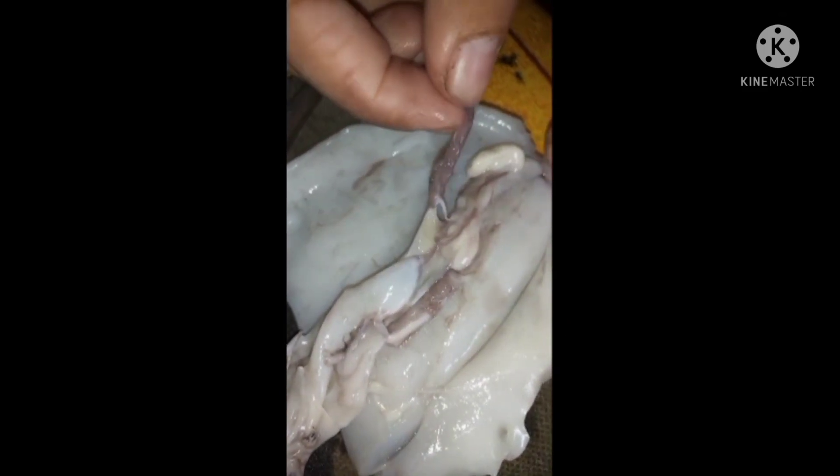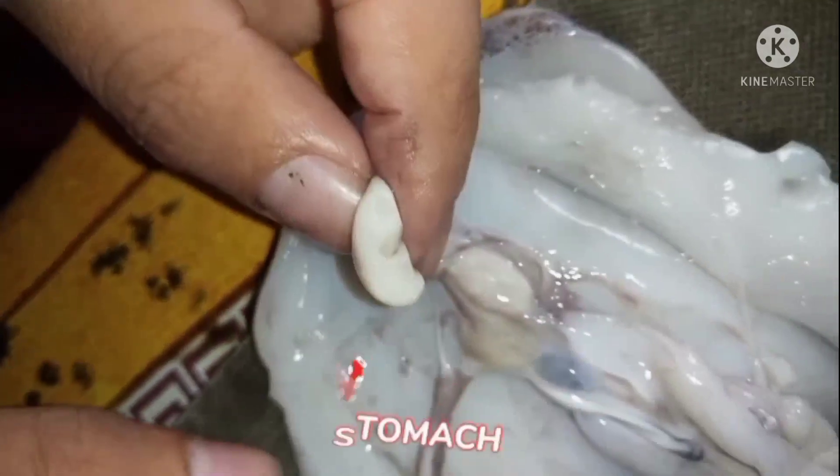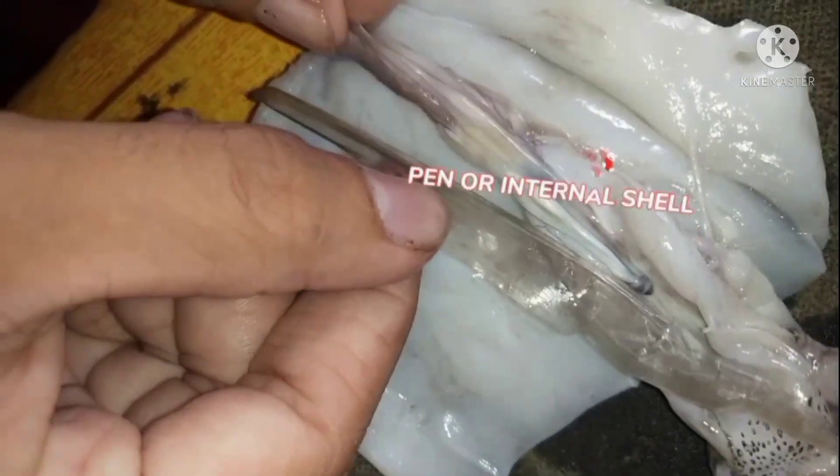heart, the gonad, stomach, and the last is the pen, or internal shell. That's all, ma'am. Thank you.